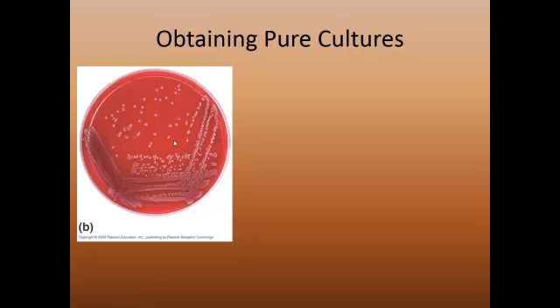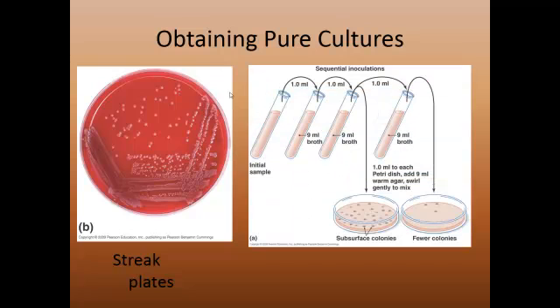We would stain it and hopefully do some testing on it. So we call that a streak plate. Now there's another method where we can use both broth media and solid media.